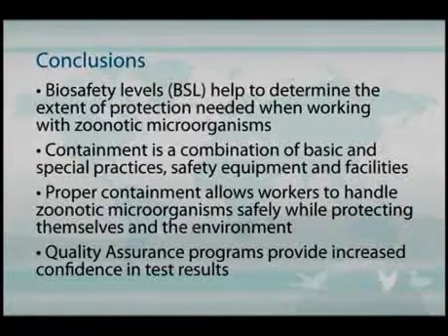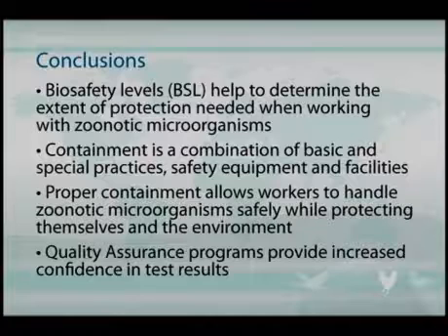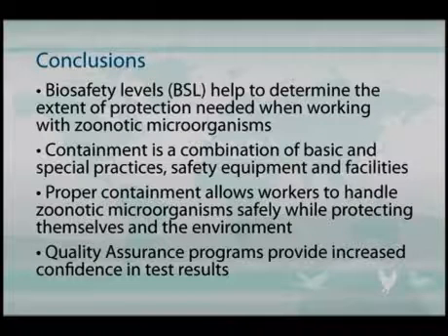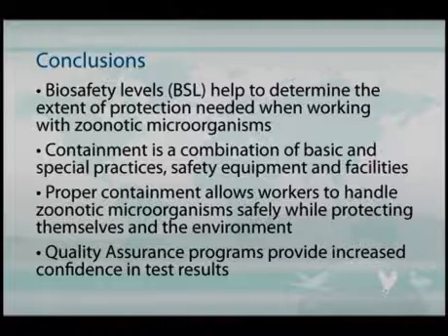Now, in conclusion to what we've covered in this presentation, we know that there are different biosafety levels, and these biosafety levels are designed to help determine the extent of protection needed depending on the organisms that you work with. Containment is not just one activity. It's a combination of basic and special practices, safety equipment, and facilities to make sure that we have a safe work environment for everybody in that environment.